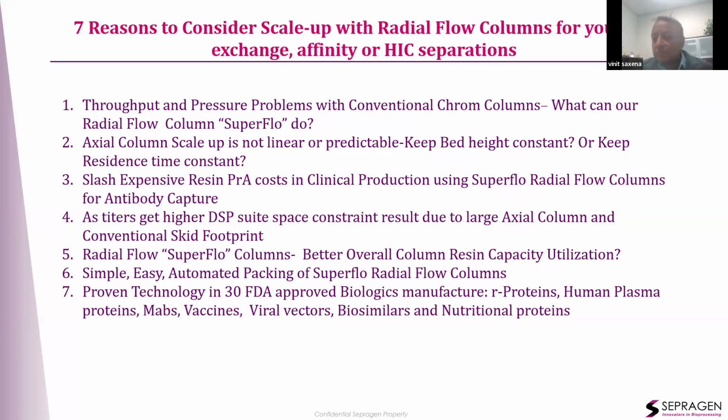Push it to maybe 85%. Because in packing there are variations, etc. You've got a lot of money tied up in resins in the process, and you're taking 10, 15% off the top because of inefficiencies in how the column is packed and the capacity utilization of that column.